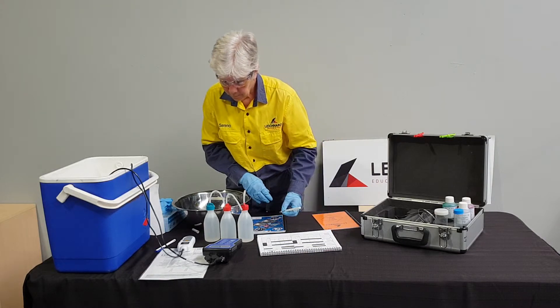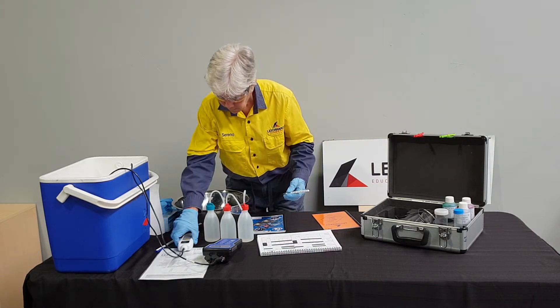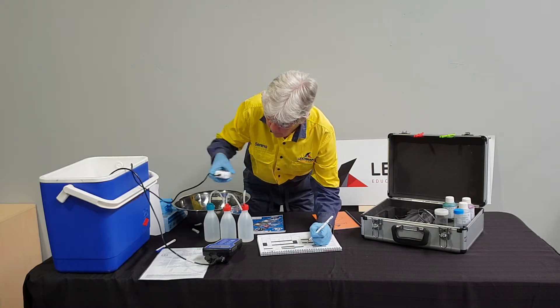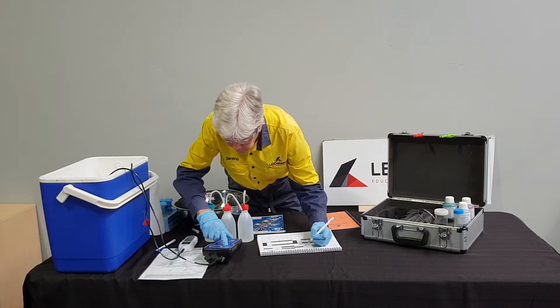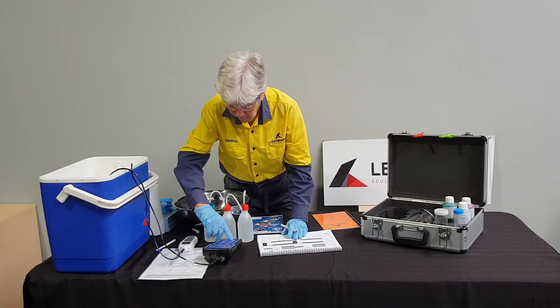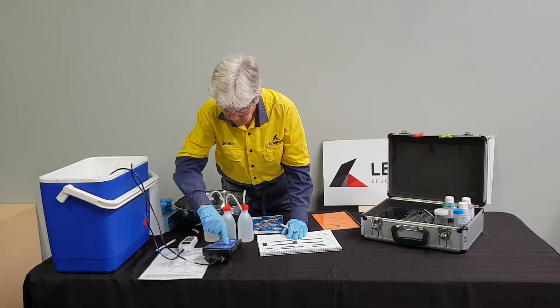Now Serena records the temperature of the certified thermometer and the temperature on the metre. To calibrate the metre, Serena follows the process as set out in the operating manual and completes the paperwork.